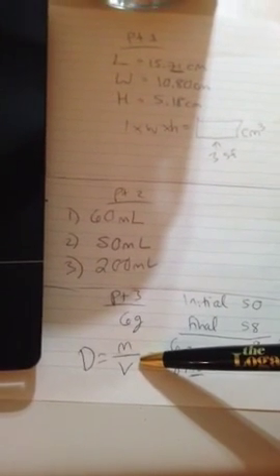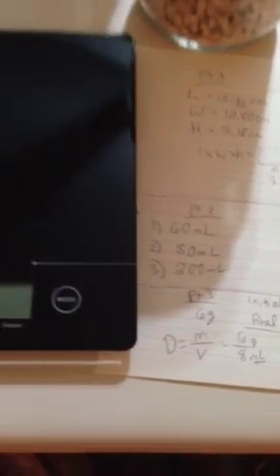Ultimately, you're going to be comparing whatever density you find to the one that's available online as a theoretical density, and we'll be finding percent error. So make sure you get 3 replicates of your data for whatever food you choose.